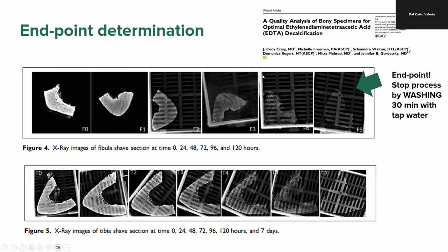Look at how many hours and days it takes for a cortical bone to decalcify with EDTA. That is why we don't usually use EDTA for everyday decalcification. But if you don't have the Faxitron, sometimes some people put a needle through the piece of bone. If the needle penetrates the bone, that means that it is soft and it's decalcified. But I highly recommend this more accurate way to do it.